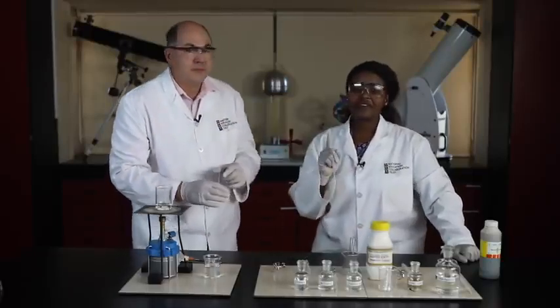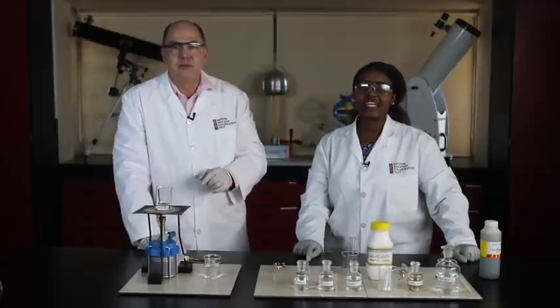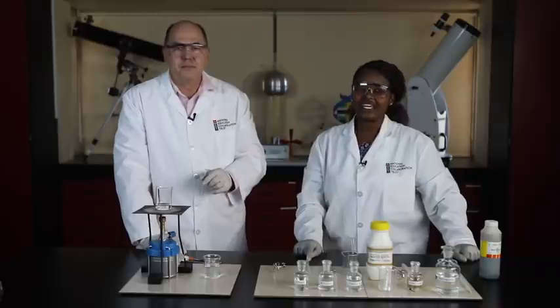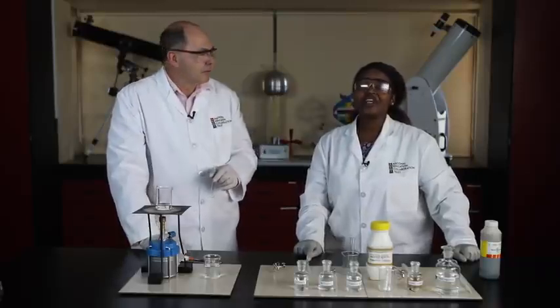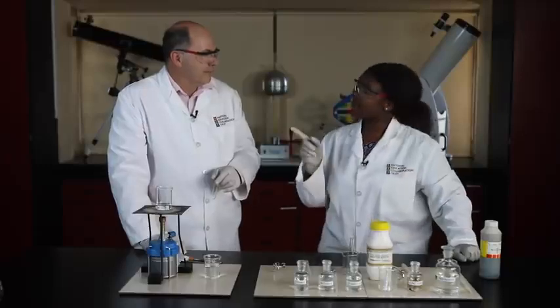smell. Before that, learners, you should record the fragrance of this ester formed by the reaction of ethanol and ethanoic acid. Later on, you can complete the other questions on the worksheet, but meanwhile, we are moving on to prepare another ester.